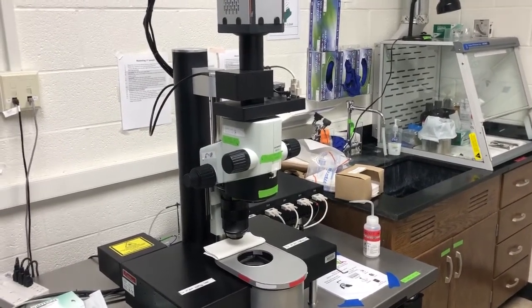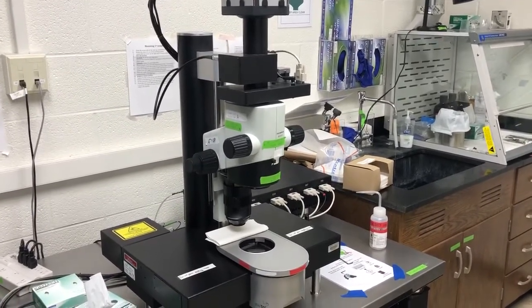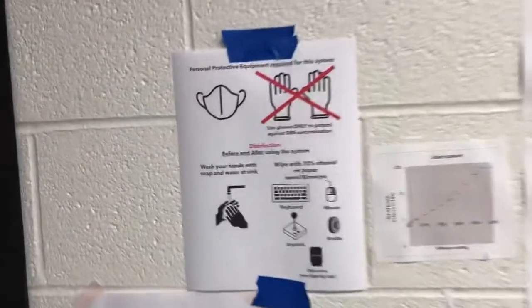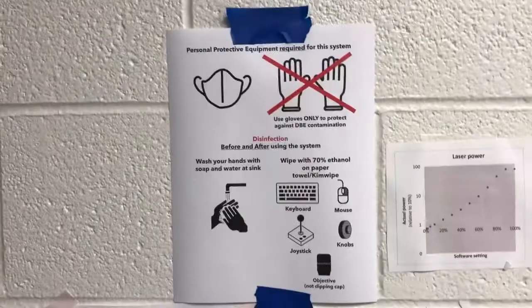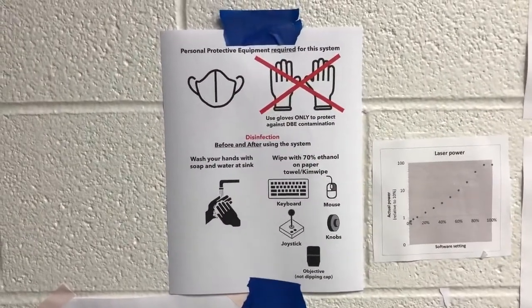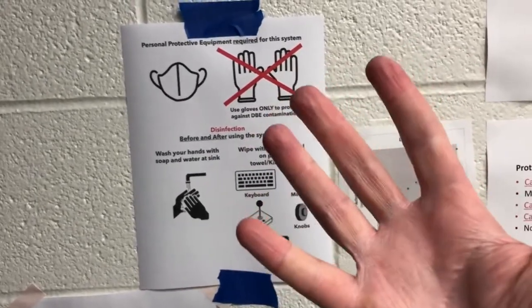So there's a lot to cover. Let's start from the very beginning, which is that under the current circumstances, we need to take special precautions due to the COVID emergency. The sign on the wall describes what we need to do for this system. We need to wear a mask, which you can see I am wearing, and we cannot use gloves on this system except as protection against contamination with di-benzyl ether. So you can see I'm ungloved.